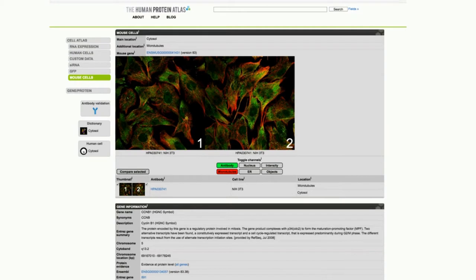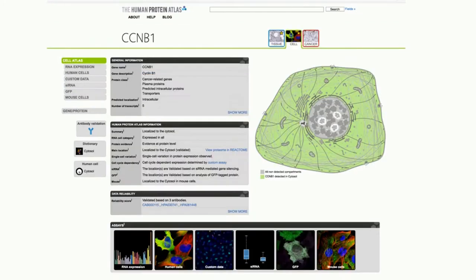So to get back to the starting page, in the very top you have a summary of all results, but if you're interested in looking at the raw data by yourself, go down to the respective section and you have all of this information available.